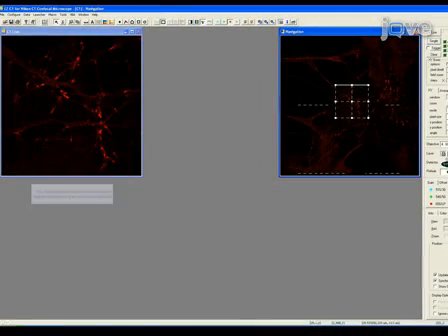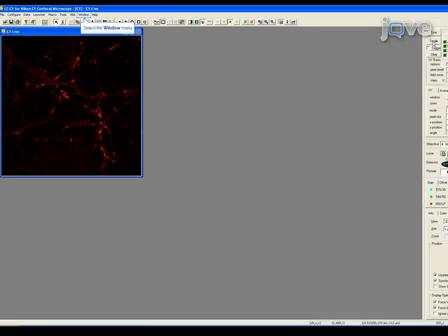Using image acquisition software, acquire a Z-stack covering a depth of 7.8 microns over 27 steps of 0.3 microns. For each step, scan first for the vGlut1 antibody to identify all glutamatergic synapses in the field, then rescan for FM1-43FX fluorescence.